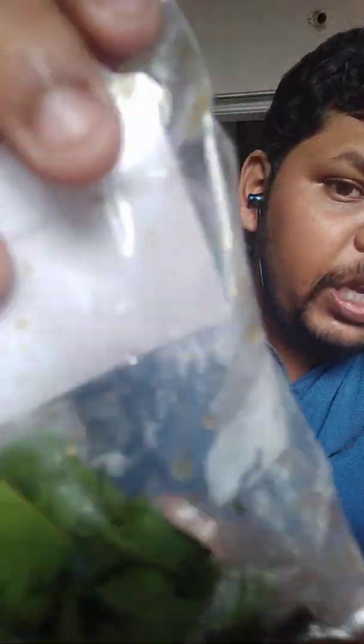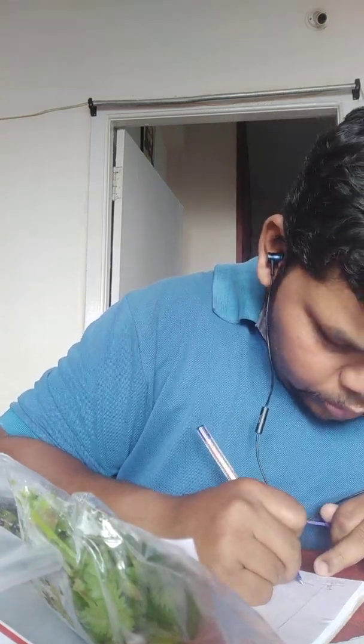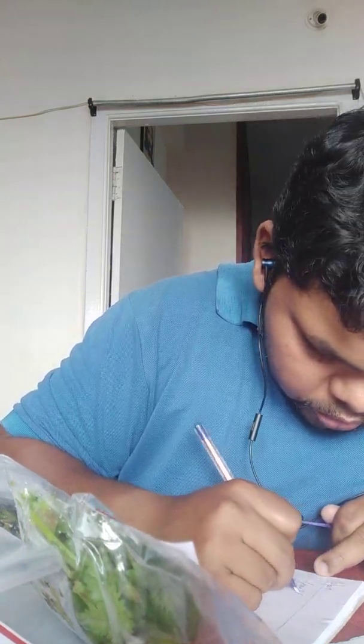Okay, so you can see there's some kind of a greenish liquid forming. Greenish liquid formed on the spinach. Note it down. Greenish ooze from the spinach sample.